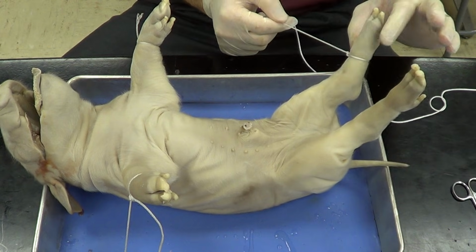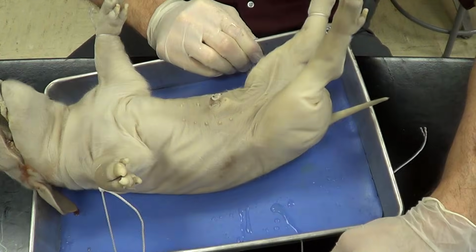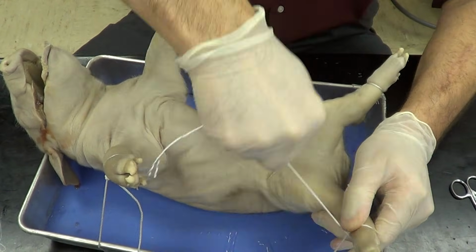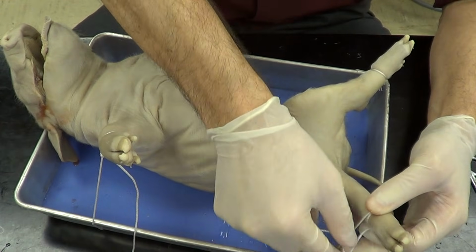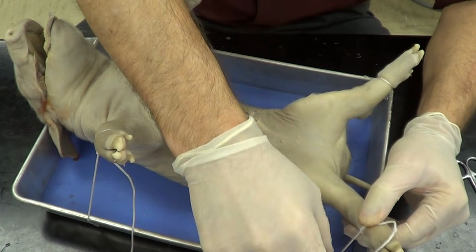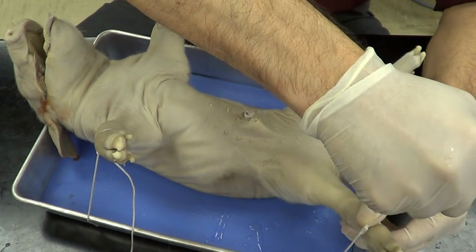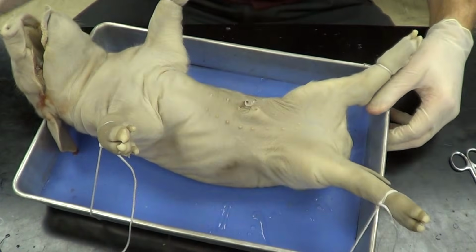Again, I've taken the liberty of already tying a knot around one leg. I'm going to bring this around the underside of the tray, and we'll go ahead and tie this leg off. And there we go.